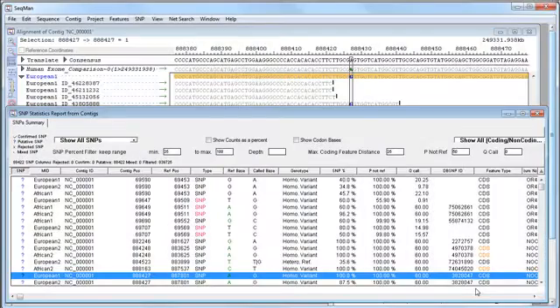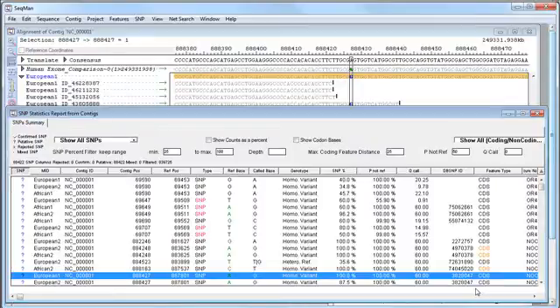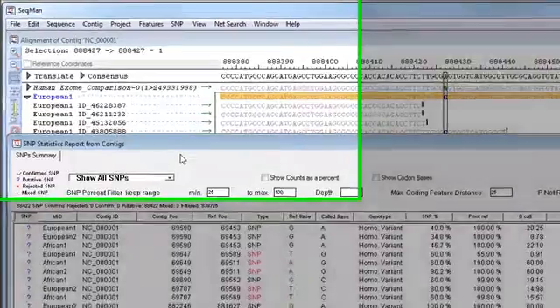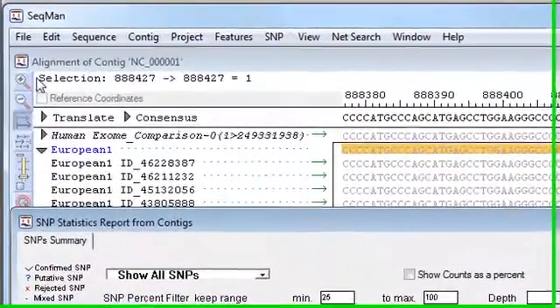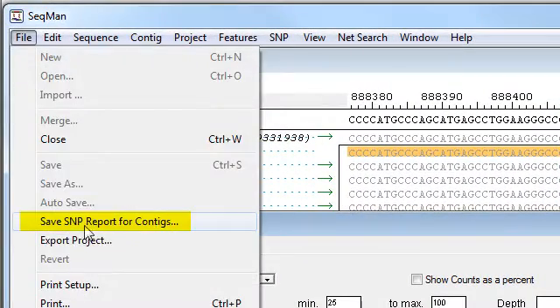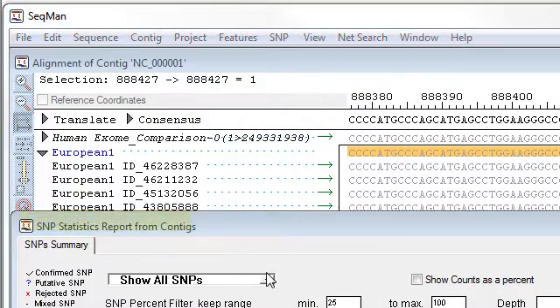Now, for large-scale multi-sample projects, the next step to go further with comparing SNPs across multiple individuals is to send our data to ArrayStar. To do that, you can export the data from the SNP report by selecting File, Save SNP report for contigs.